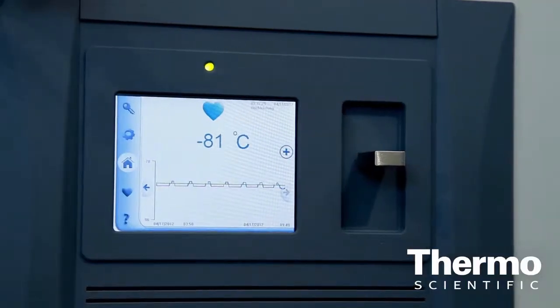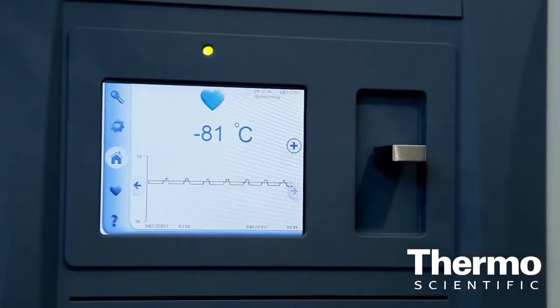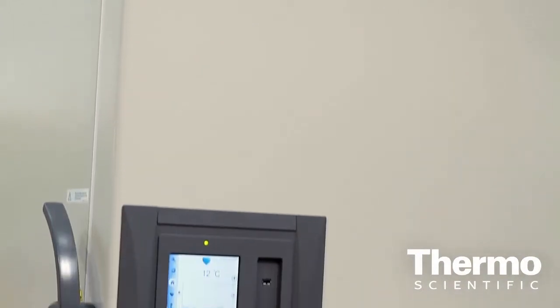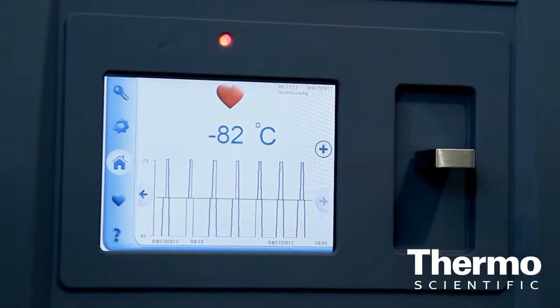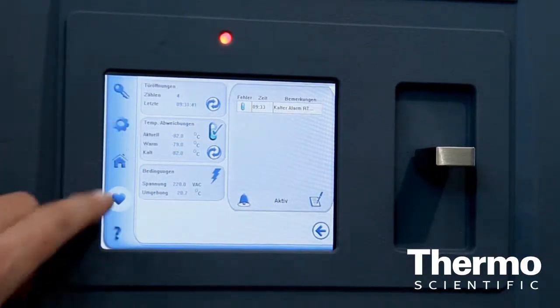The LCD control shows you when there's been a change. If it changes from blue, where everything's running correctly, to yellow, an event has happened — and you, as a scientist, need to know whether it's a serious event or whether it can be remedied yourself. If it goes to red, that's when you need to move your samples. So it's all about sample integrity, ensuring that you can remove your samples as and when required.